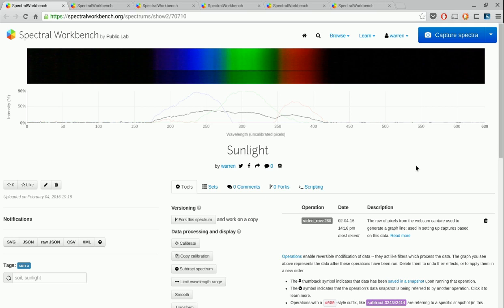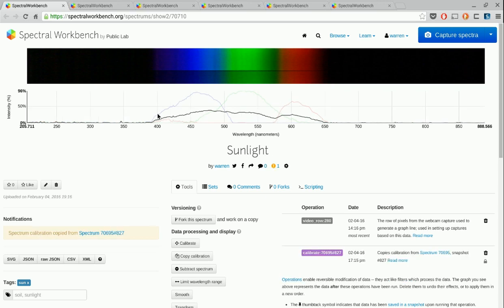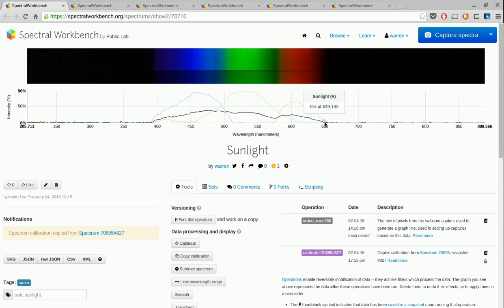And what happens is it copies that calibration onto this, and then we know exactly what wavelength each of these were, to the precision possible in the calibration itself. And it's noted here that the calibration is copied. But how do we actually make that calibration? Well, I'll show you how.